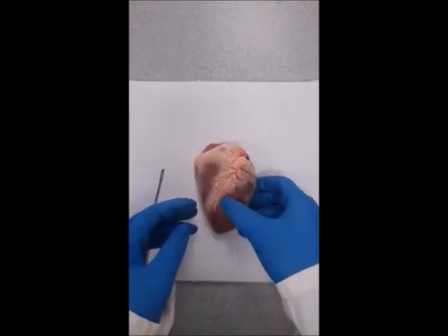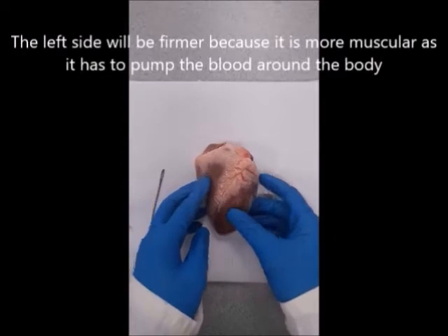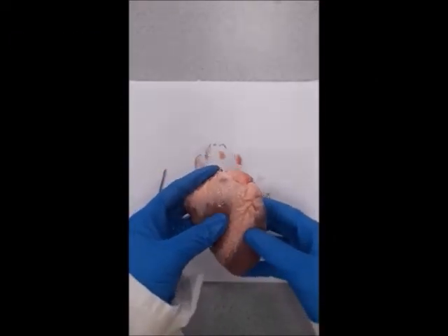The right side is actually quite squishy. That's because the muscle on the left is much stronger, to be able to pump blood out to the body.